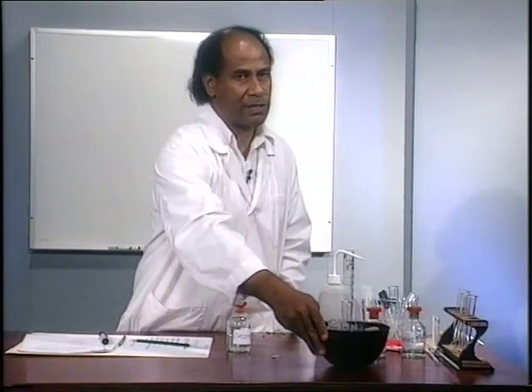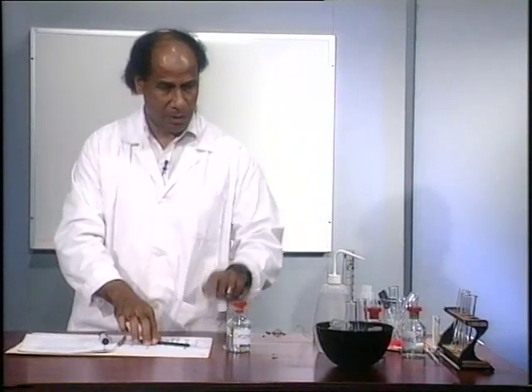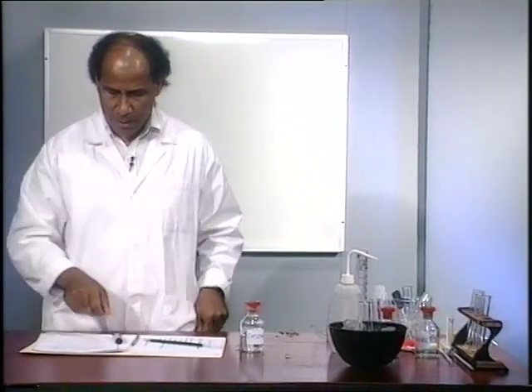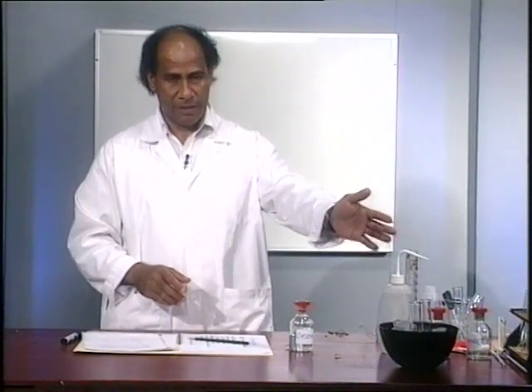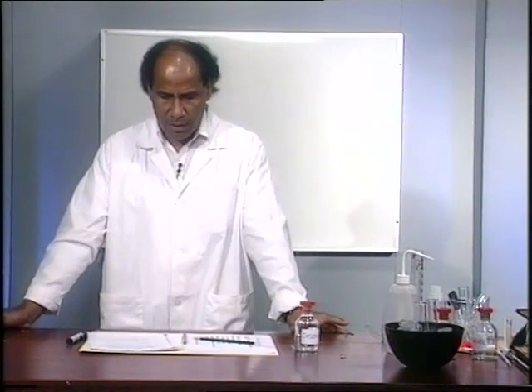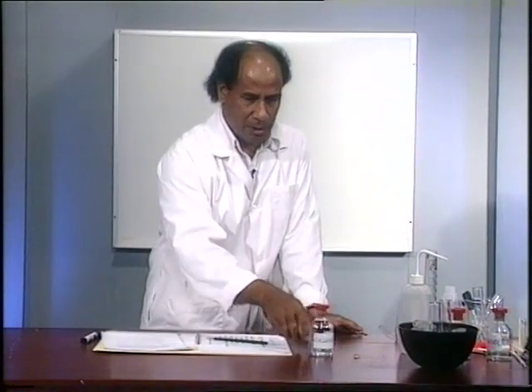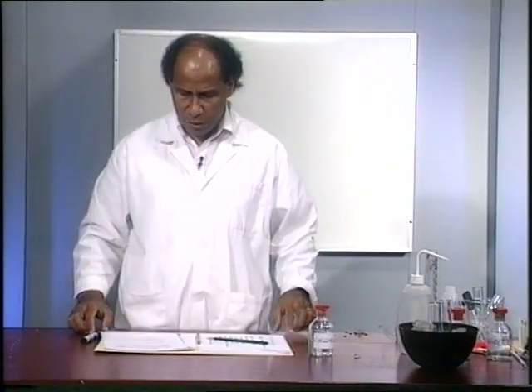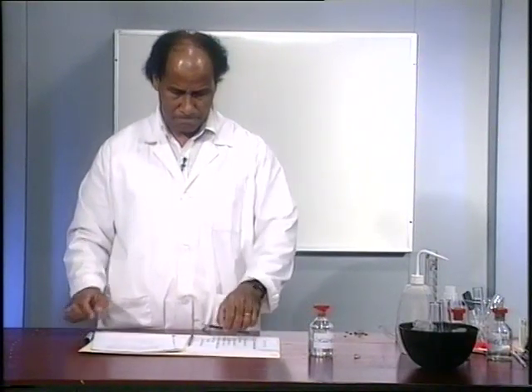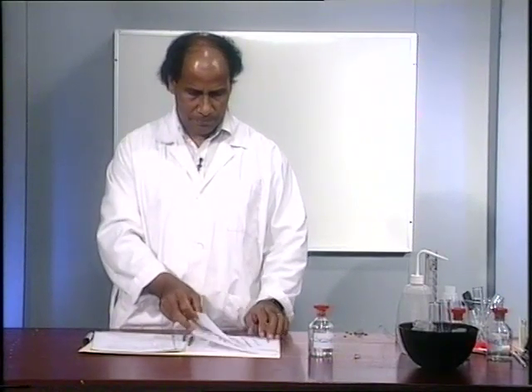So we will leave this for some time, and we'll come back to that freezing mixture with our two solutions in it. All right. So while that is solidifying, freezing, we will move on to the next part. And then we'll come back to that after we find that they are frozen. Part 2 talks about volume change on mixing. Volume change on mixing.